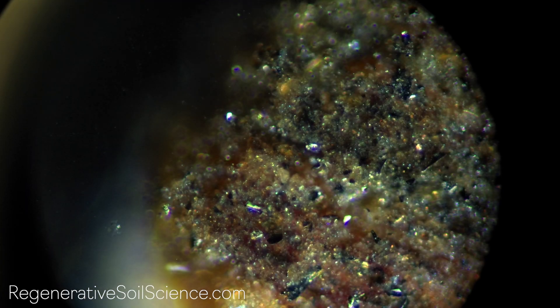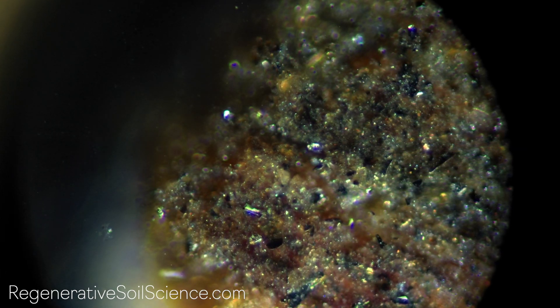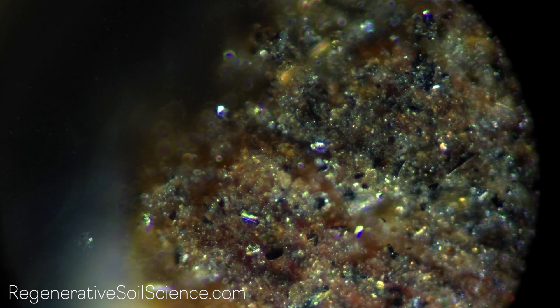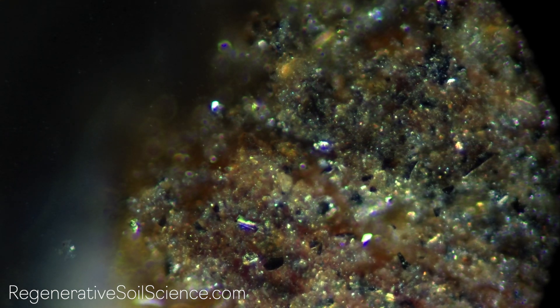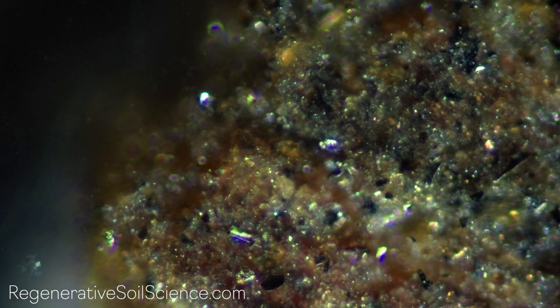There's so much to see at different wavelengths that are closer to what these spaces and microbes actually experience. But what's more, especially in this instance, I find it more instructive. What we are looking at here is a woody compost mixed with biochar. You can see the striations in this organic matter particle — it really does look like wood. You can also see the biochar chips and crystalline structures all over the surface. The glittering orbs and flashes of light are microbes feeding, reproducing, and dying on the surface and even inside of this particle of decomposing wood. So it is habitat. It is food.